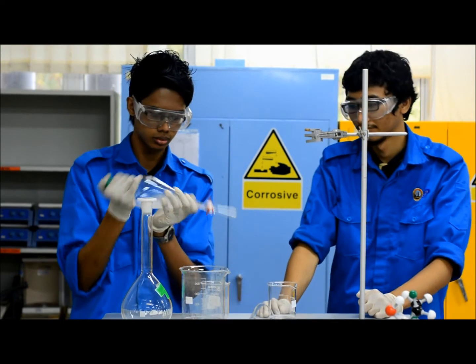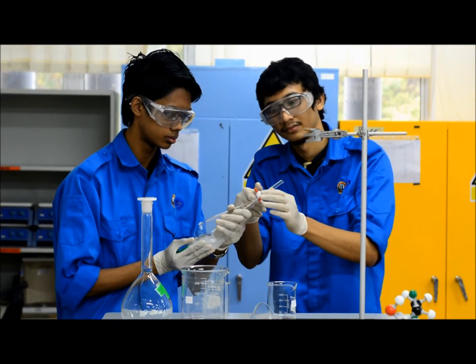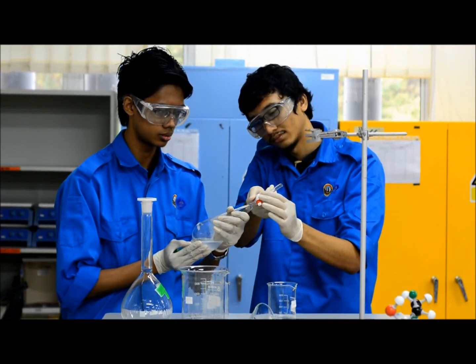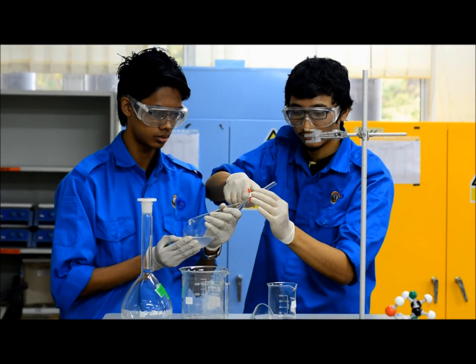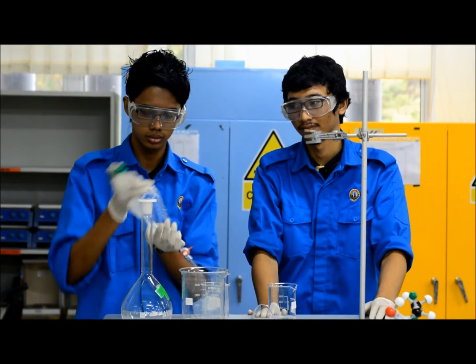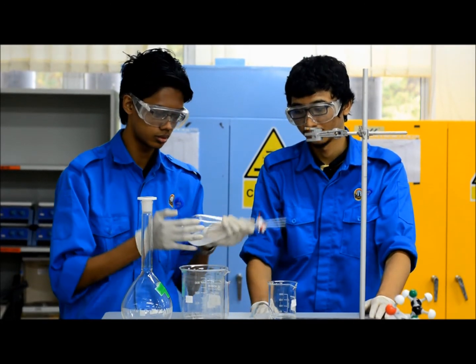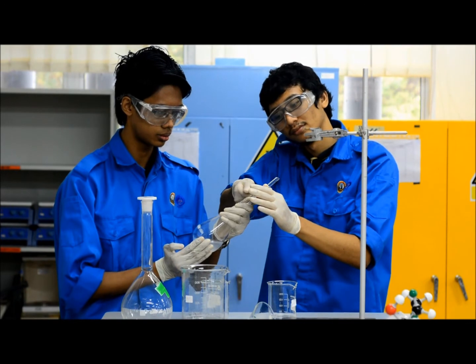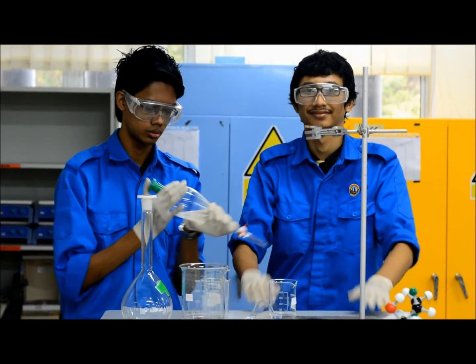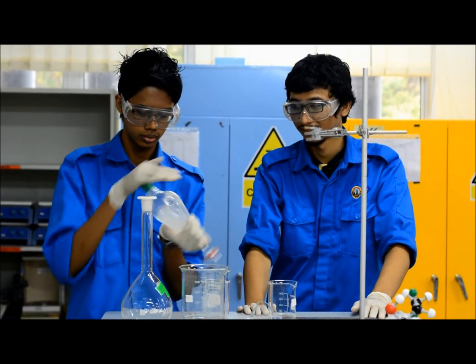After we shake the separatory funnel, point the stem out and open the stopcock to release excess pressure gas. Repeat this procedure until only a small amount of pressure is released when it is vented. For our experiment, we repeated this step 3 times.